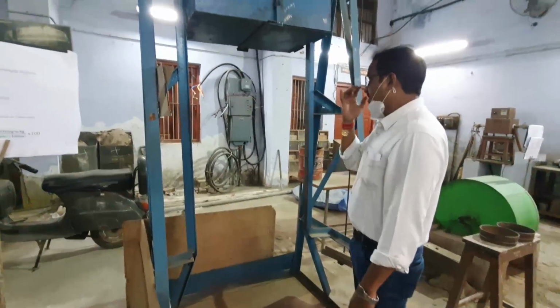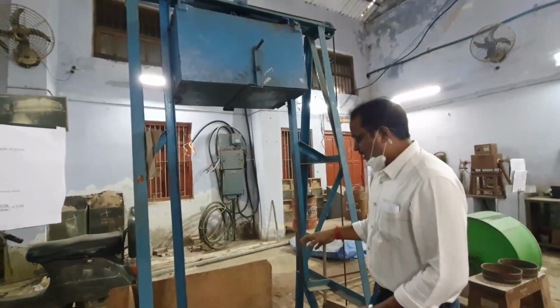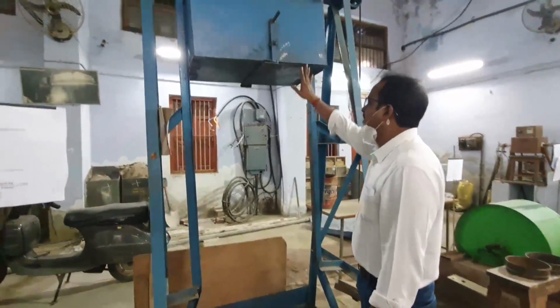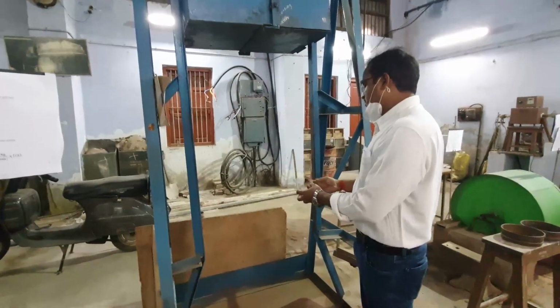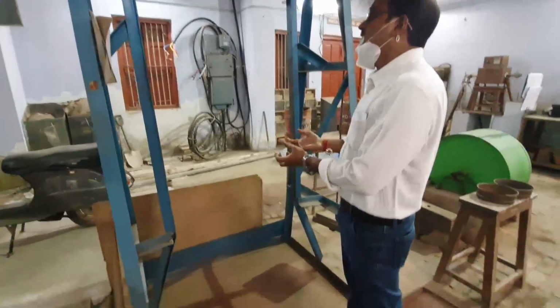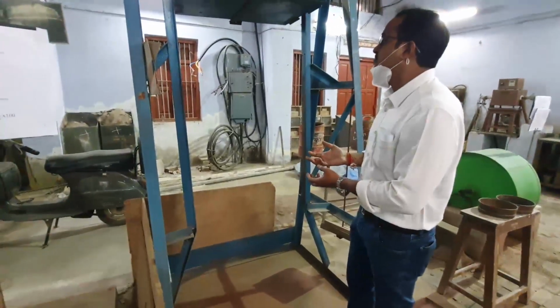So, how much material will be retained? We have to do the experiment at least 4 times. We keep the material inside the box and make it fall. The material will fall; some pieces will be broken into smaller pieces, and some will be retained in the same size. So what size is retained? The plus 10 mm size retained.